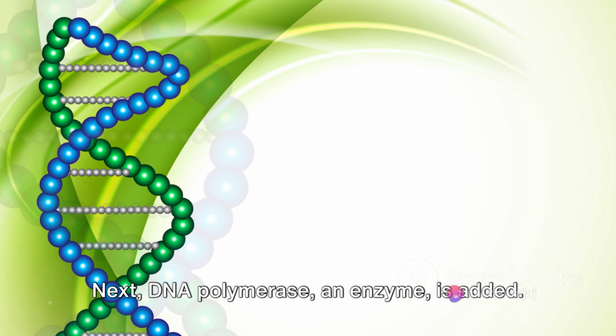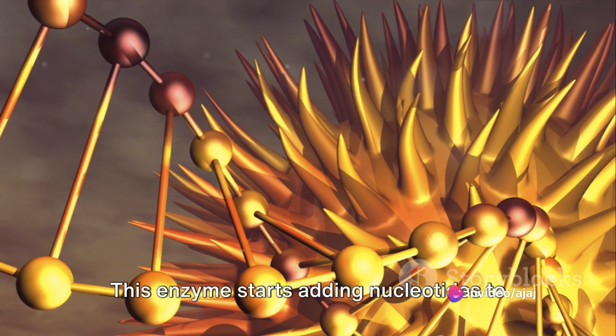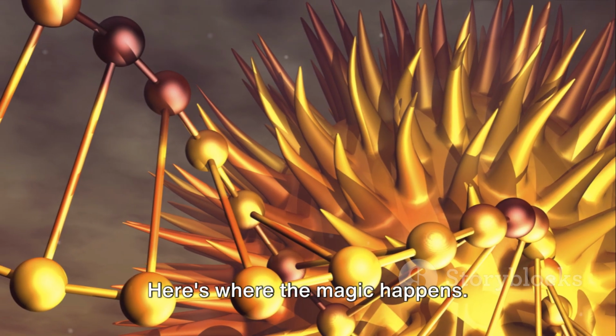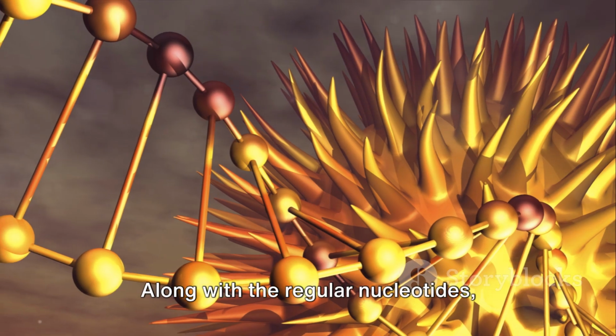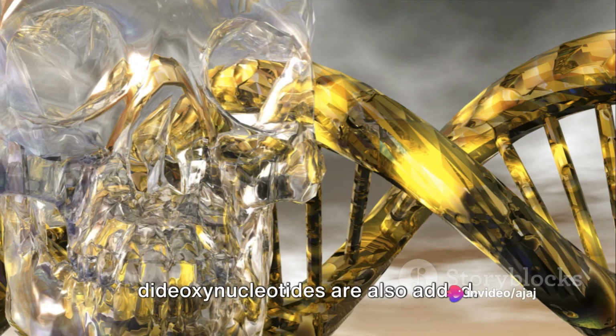Next, DNA polymerase, an enzyme, is added. This enzyme starts adding nucleotides to the primer, creating a new DNA strand. Here's where the magic happens. Along with the regular nucleotides, modified nucleotides called dideoxynucleotides are also added.